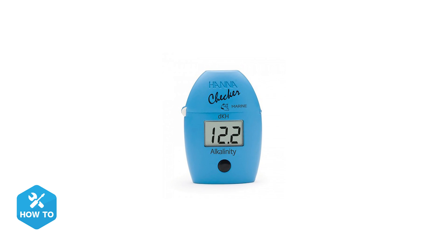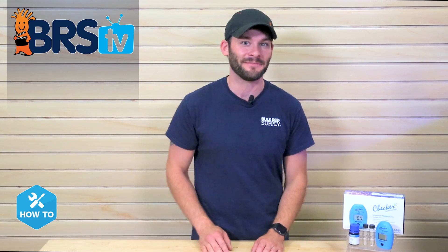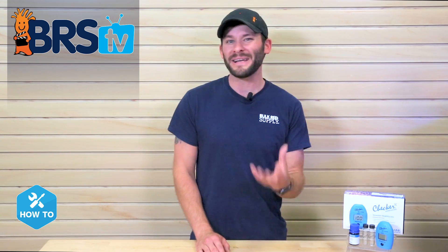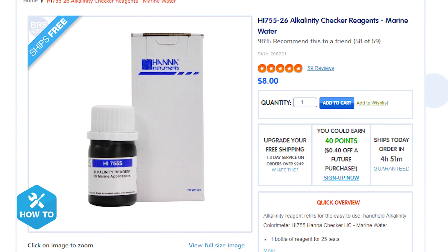This checker is one of the easiest to use and really only requires one of the two cuvettes at a time, which can save you even more time during testing and cleaning. On top of that, once you've used all the included testing reagent, replacement reagents are less than 10 bucks, and one will yield you about 25 tests.